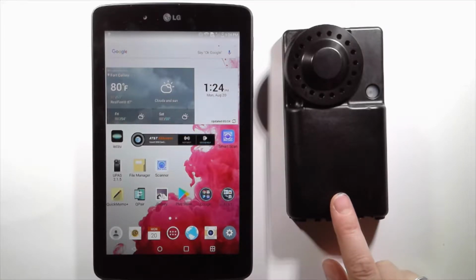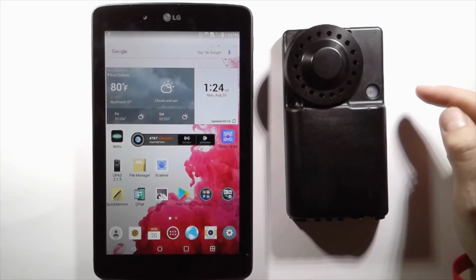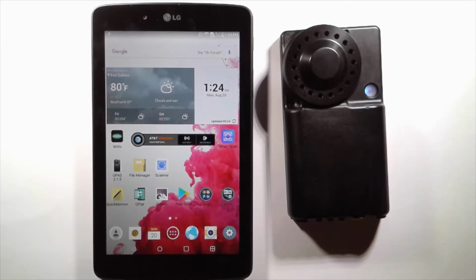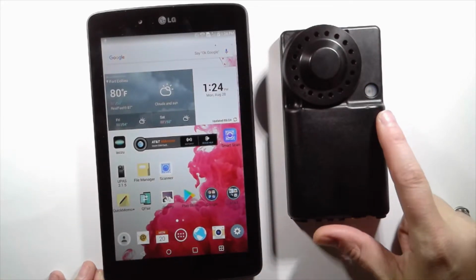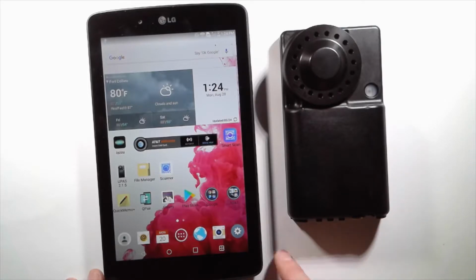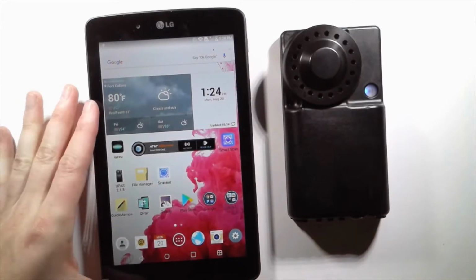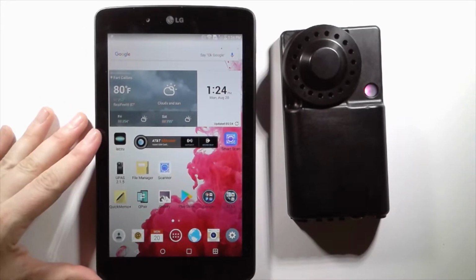So now before you get started, I'm going to turn the UPAS on. After a push and hold for about 5 seconds, the UPAS will go through its initiating startup sequence. And in the meantime, I'm going to come over to the Android device here. One thing before we connect to the UPAS.